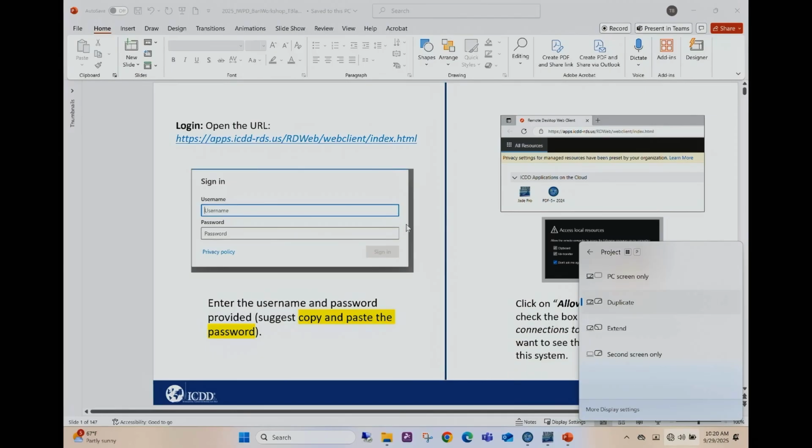You should have a username and password, and for the next 2 weeks you have access to the database. I'm here for the next couple of days as well, so if you have questions, you can ask me. I'm going to be using the database on my desktop because I don't know if I'm going to be in or out, and we'll proceed as best we can, okay?